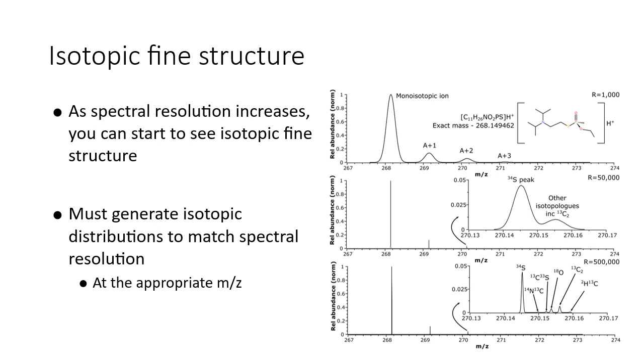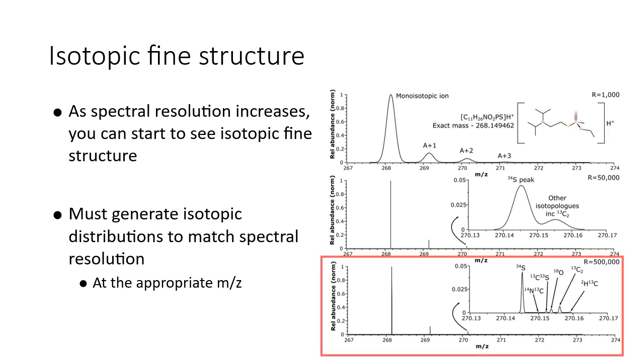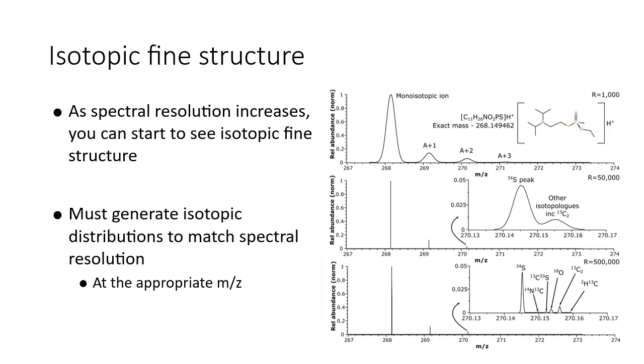It is important to consider the signal-to-noise ratio though. So if we analysed VX on this last instrument, but where the VX signal was relatively weak, the A+2 ions may have an intensity so low that they wouldn't be detected, or where their position or relative intensity would be greatly affected by the noise. And under those circumstances, we would obviously be much less confident in our ability to correctly assign a formula to that monoisotopic peak.